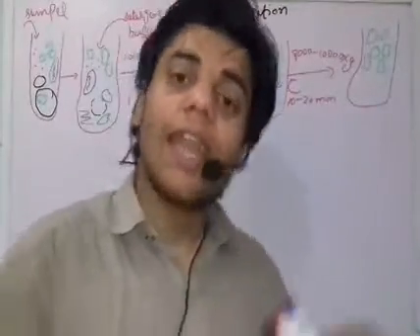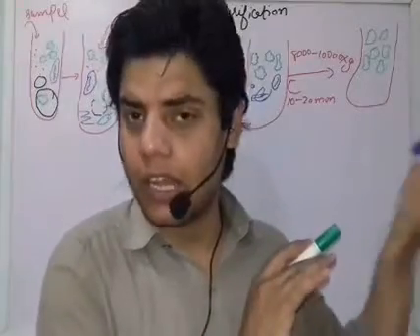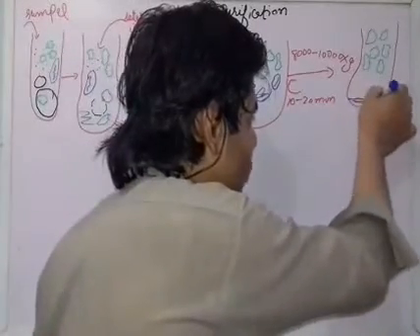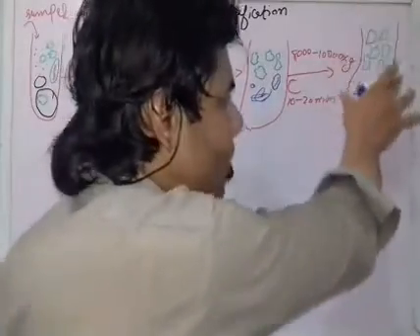So active and inactive, complete and incomplete viruses are present here. We also get some precipitation-like things at the bottom. Fine. So heavy particles which are present inside the mixture.